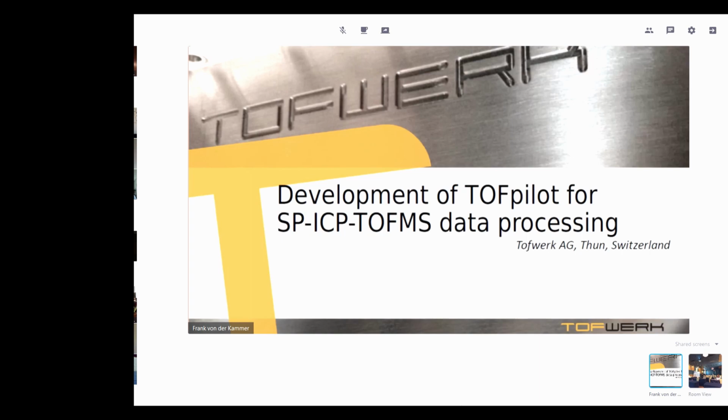Coming to the probably most recent developments in terms of single particle ICP-MS, and probably also the most far-reaching developments: using time-of-flight mass spectrometry in single particle ICP-MS to enable the spectral analysis, the multi-element analysis of single particles in the femtogram range.